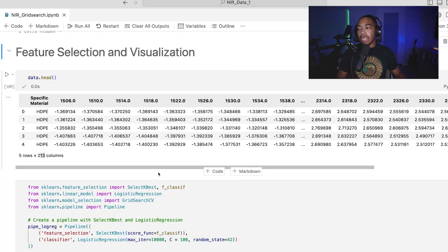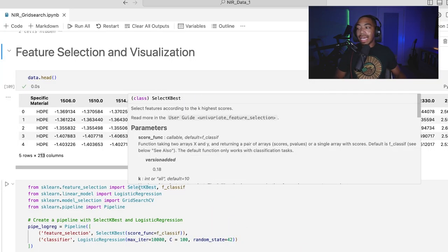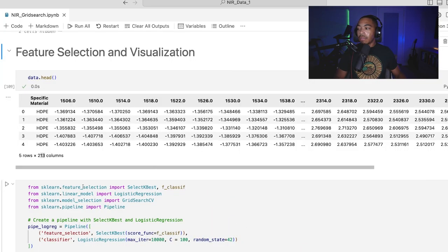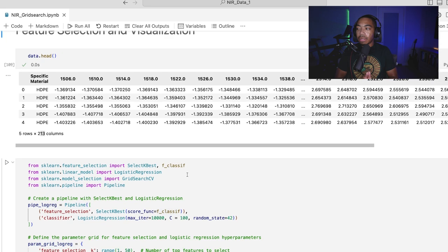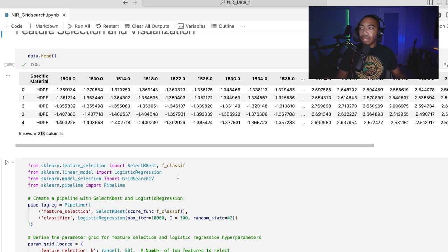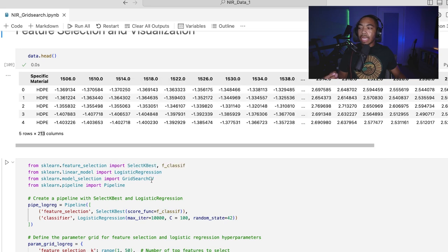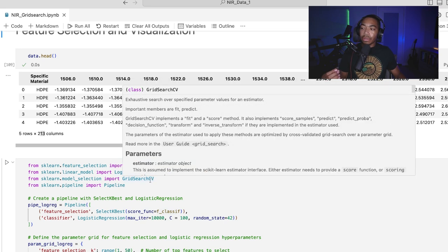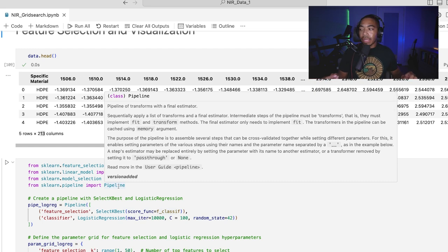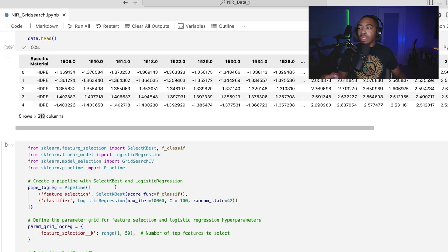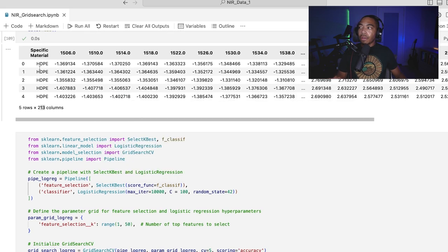Those techniques are going to be the F_classif and the SelectKBest from the feature selection module. Some of this other stuff we've demonstrated in previous videos where we're going to use a logistic regression classifier in combination with GridSearchCV to find the optimal set of parameters and a pipeline to allow us to chain those methods together to build a classification model for our various plastics.